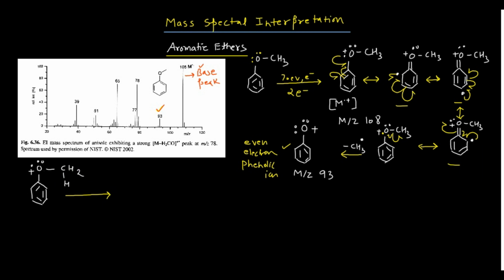So I am breaking this particular bond, and if I break this bond, what will happen? One of the electrons will go to the oxygen atom, and this hydrogen along with 1 electron will come to this position, and this will break completely heterolytically and the electron pair will shift here.